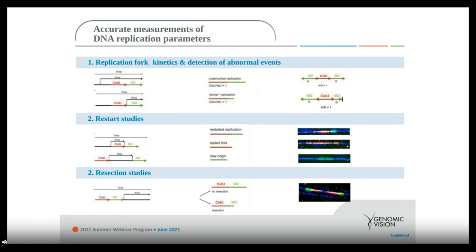So this is applicable for many biomarkers and many drugs. For example, the PARP inhibitor, to see whether there is resistance onset to PARP inhibitor. The resection study might be analyzed, or it can be checked for the firing of new origins, and so on for all the other biomarkers and targets that are being built as new anti-cancer development drugs.